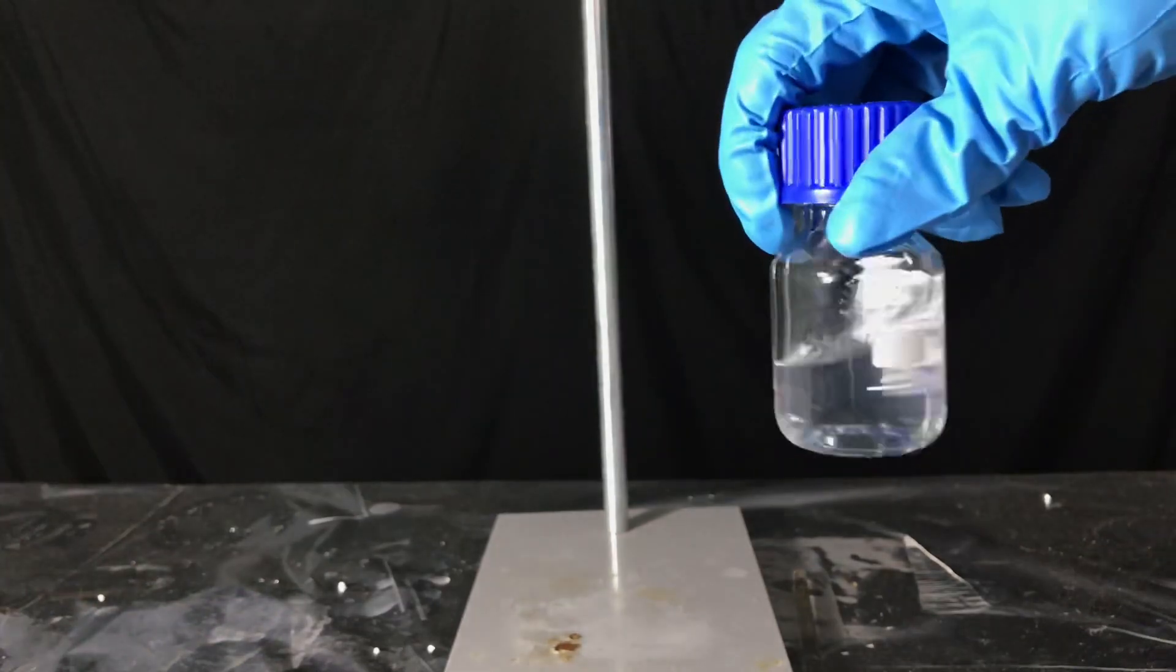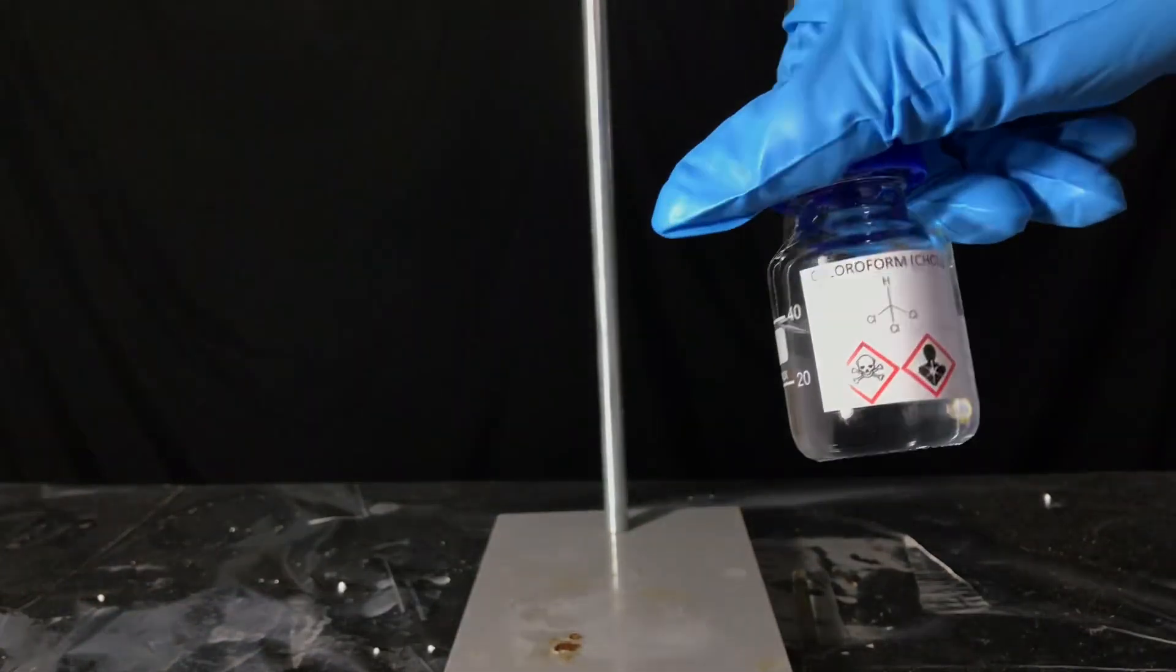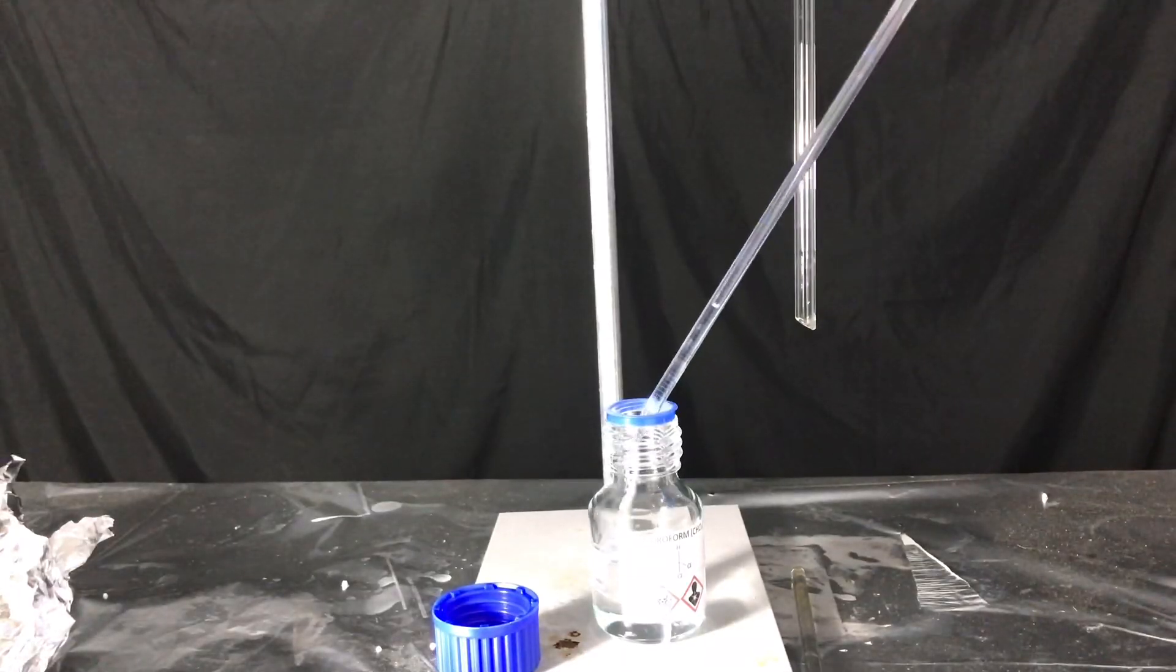And there you have it, a nice bottle of chloroform. We ended up with 39 milliliters of chloroform and this corresponds to a yield of around 66%.